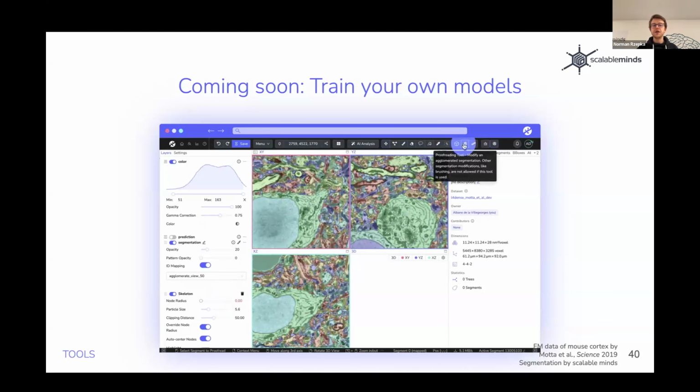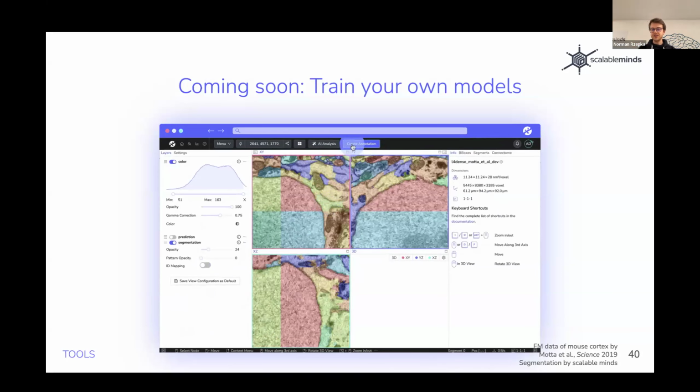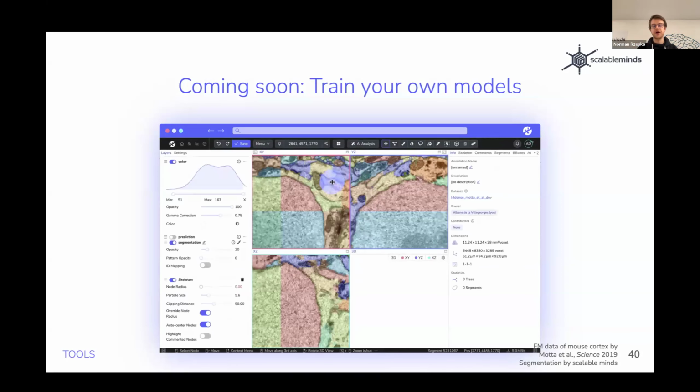and to do your analysis on top of that. So this is really what we're working on at the moment, and if you're interested in trying that out, then please reach out to us, and if you have some ideas of what we should do next, that's of course also very, very useful for us.